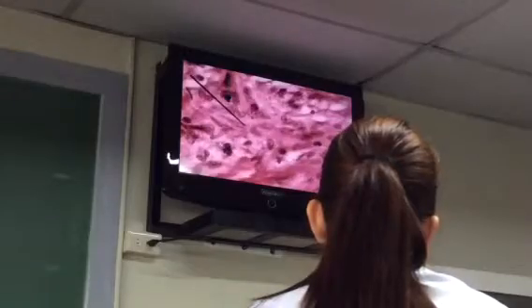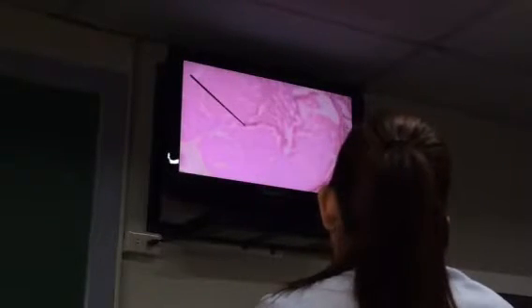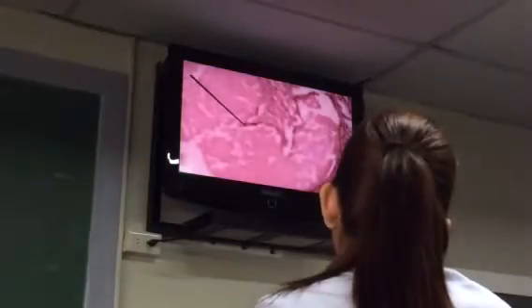Most importantly, you find there your prostatic alveolus. Let's go look at it again in low power. Prostatic alveolus. There you go. And of course, your prostatic concretions, otherwise known as corpora amylacea.